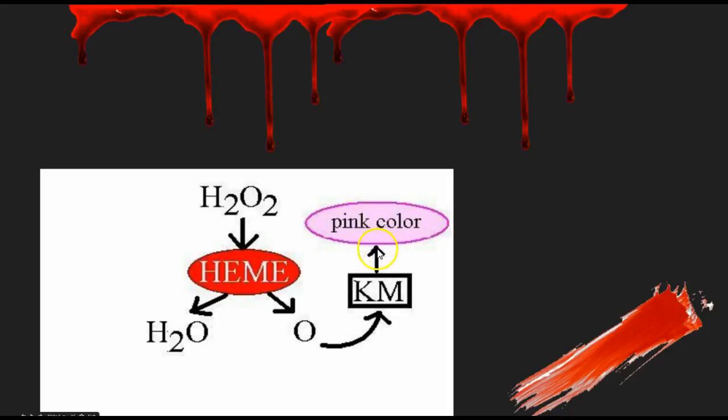So this is going to look very similar to our presumptive tests for the drug. The reason you don't want to rub your stain too hard when you're picking it up is because a positive change is going to be a robust pink, but we're also picking up a red stain. So if I really scrub that red stain with my Q-tip, I'm going to end up getting some of the red on the Q-tip, and then as that gets diluted, that might start to look a little bit pink. It's a very robust pink. It shouldn't be confused for just a little bit of blood that you picked up. But again, here's the mechanism as to how the Kastle Meyer test works. It's very simple. Make sure you have that understood as well.